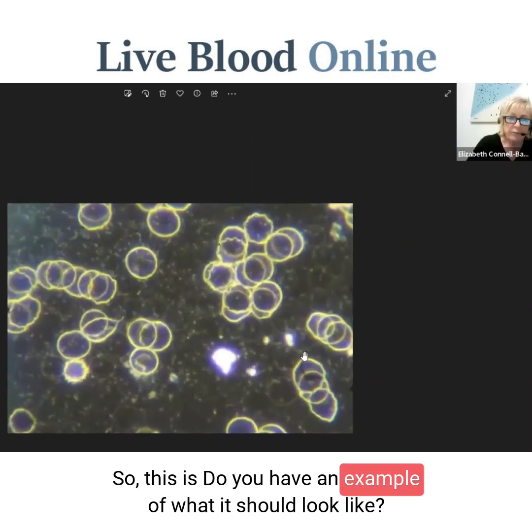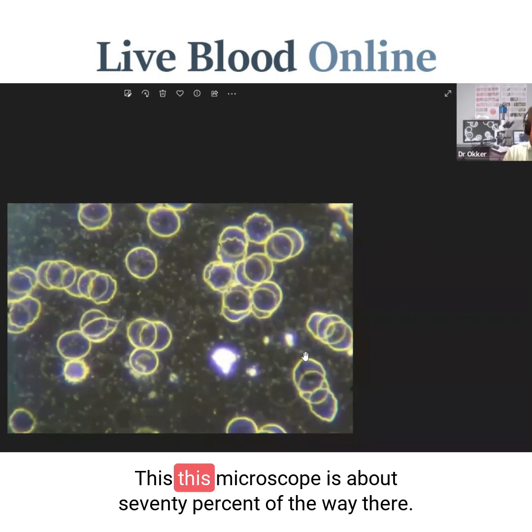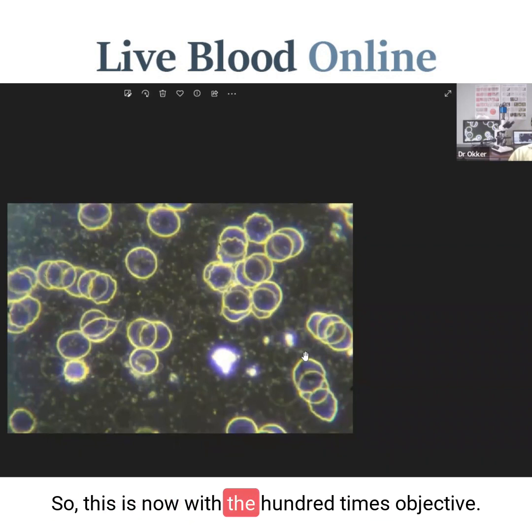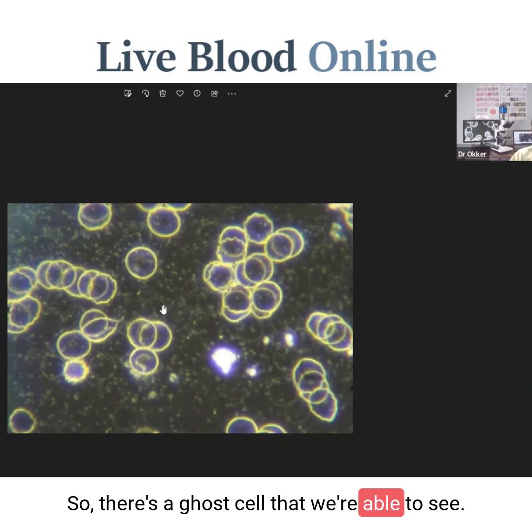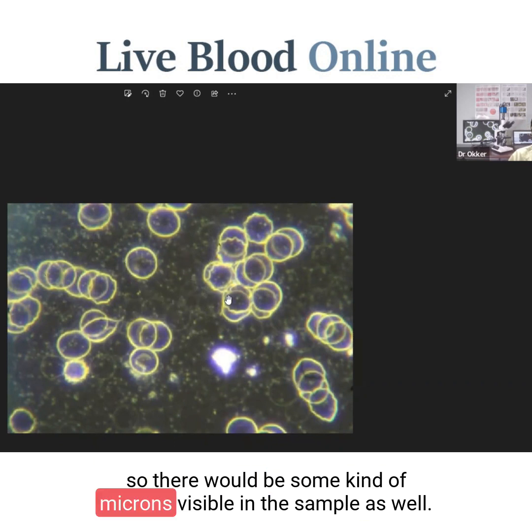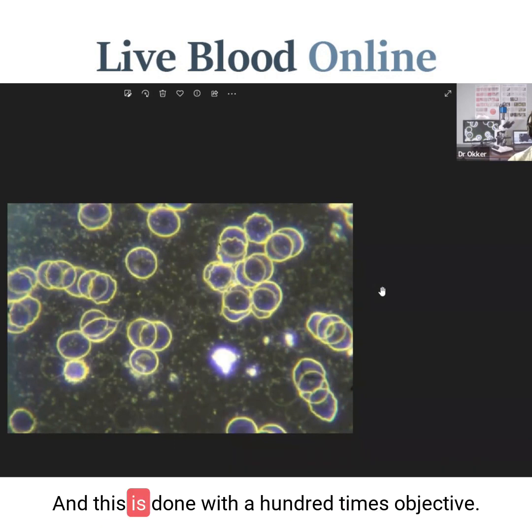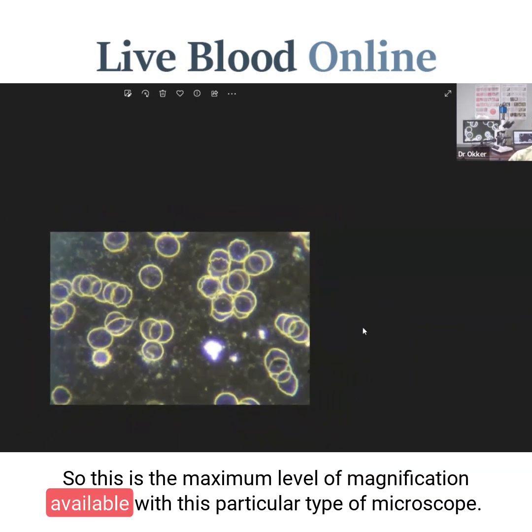This next microscope is about 70% of the way there. This is now with the 100 times objective, and here we are able to see a little bit of clarity in between the cells — there's a ghost cell visible, and some spots that would most likely be moving chylomicrons. This is the maximum level of magnification available with this particular type of microscope.